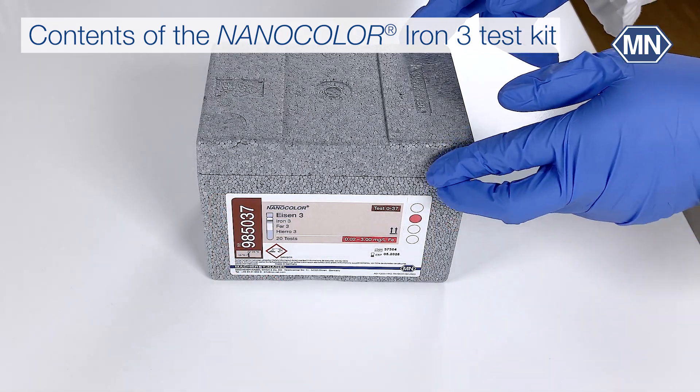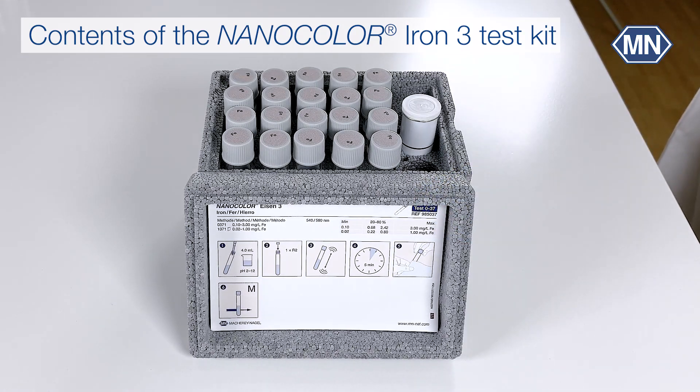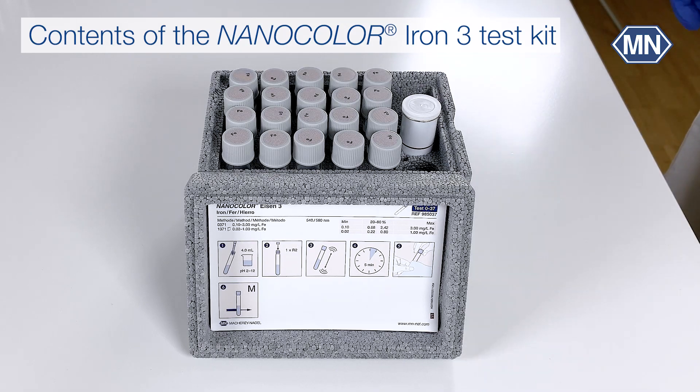There are pictogram instructions on the inside of the lid. The test kit itself contains 20 test tubes for the determinations, as well as the Nanofix reagent R2.